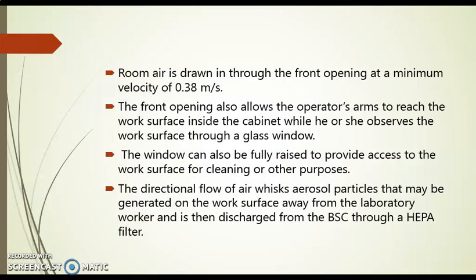The front opening also allows the operator's arm to reach the work surface inside the cabinet, while he or she observes the work surface through a glass window. The window can also be fully raised to provide access to the work surface for cleaning or other purposes.